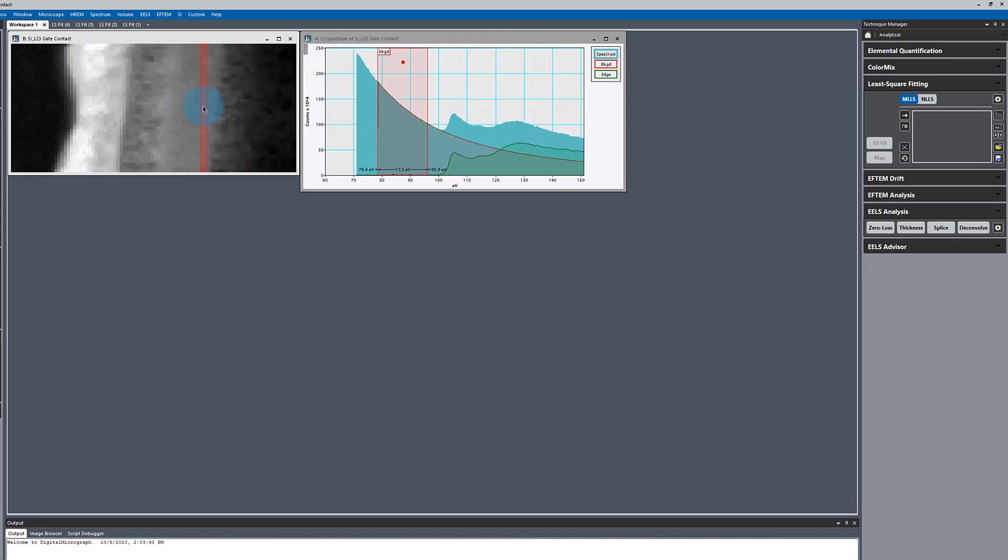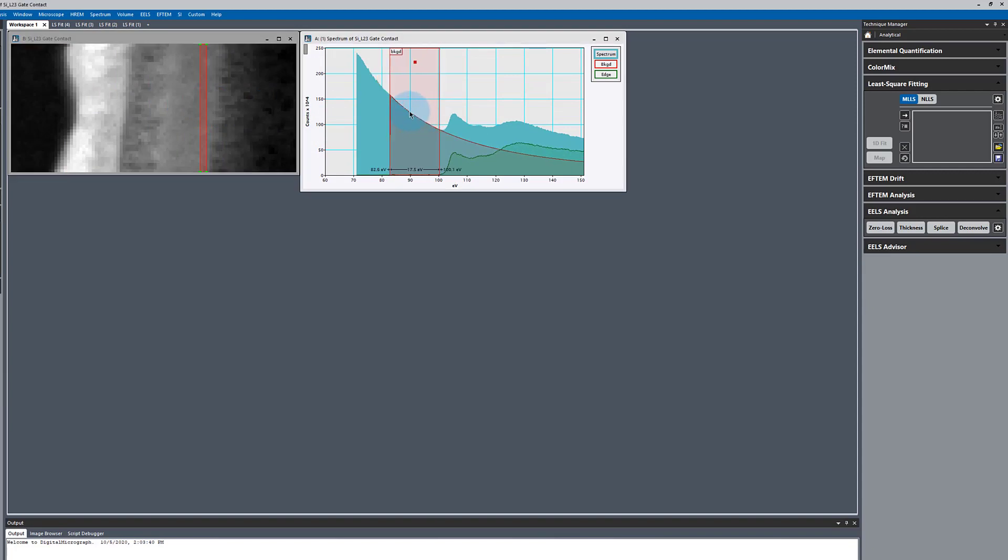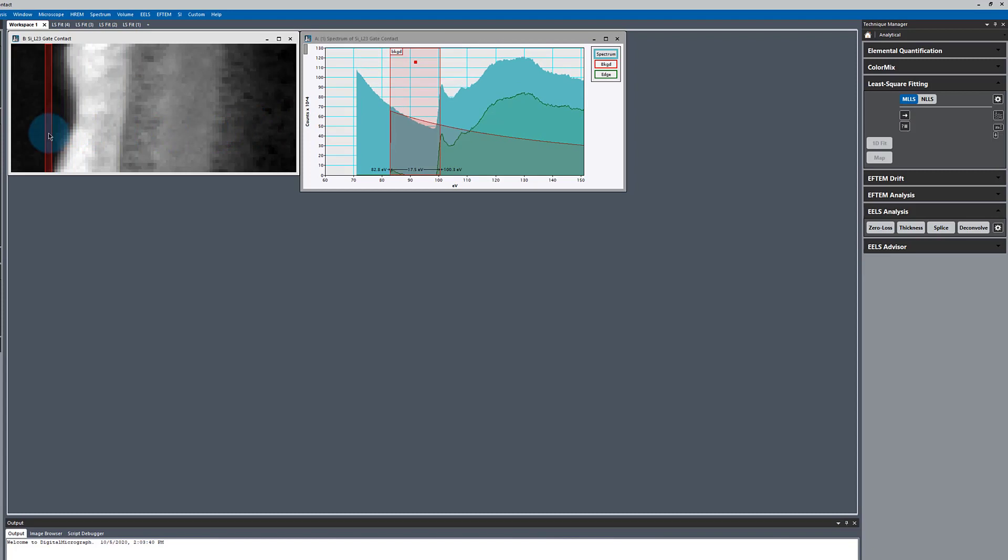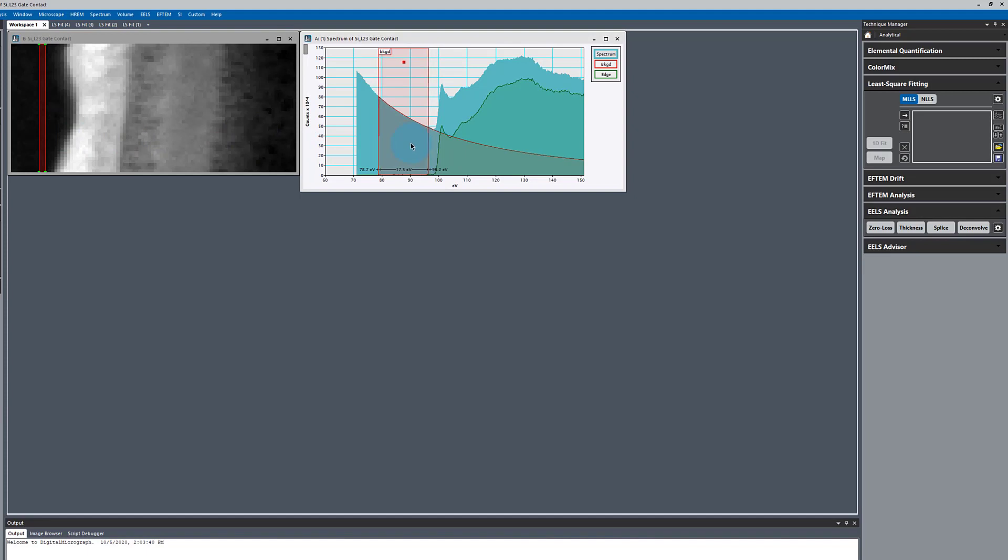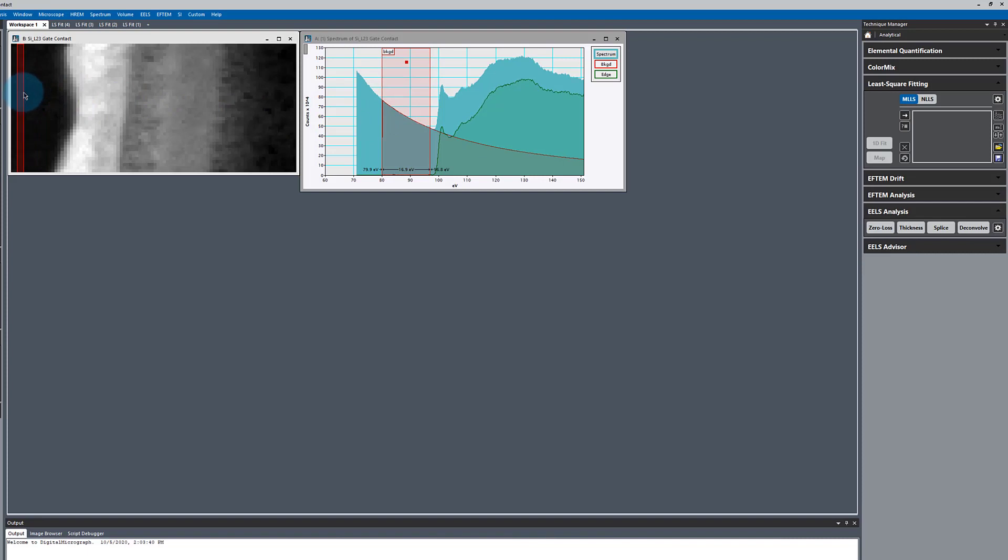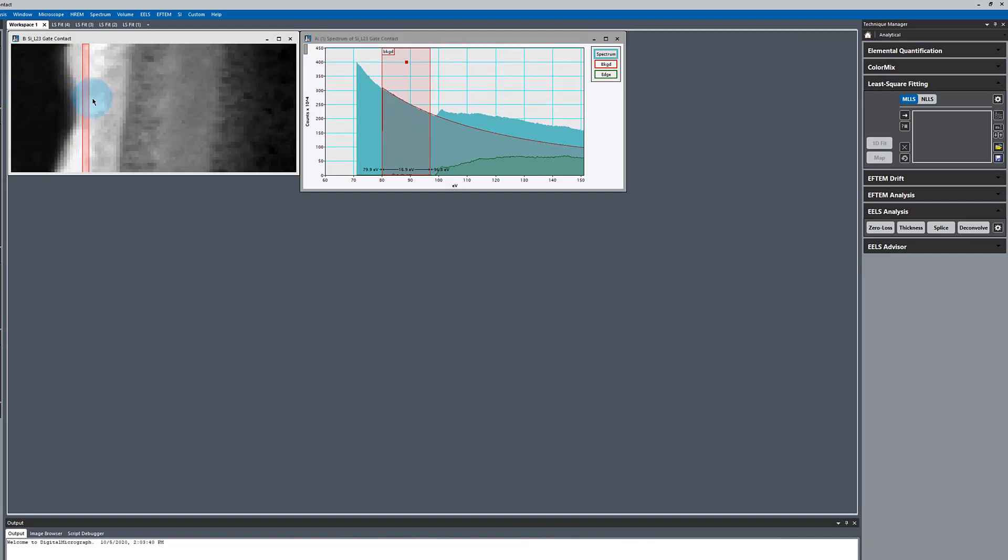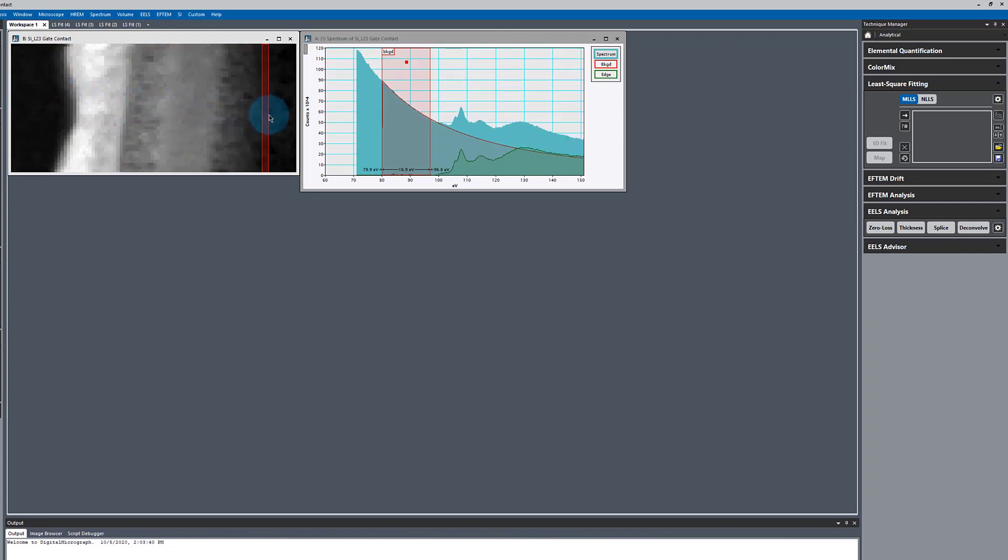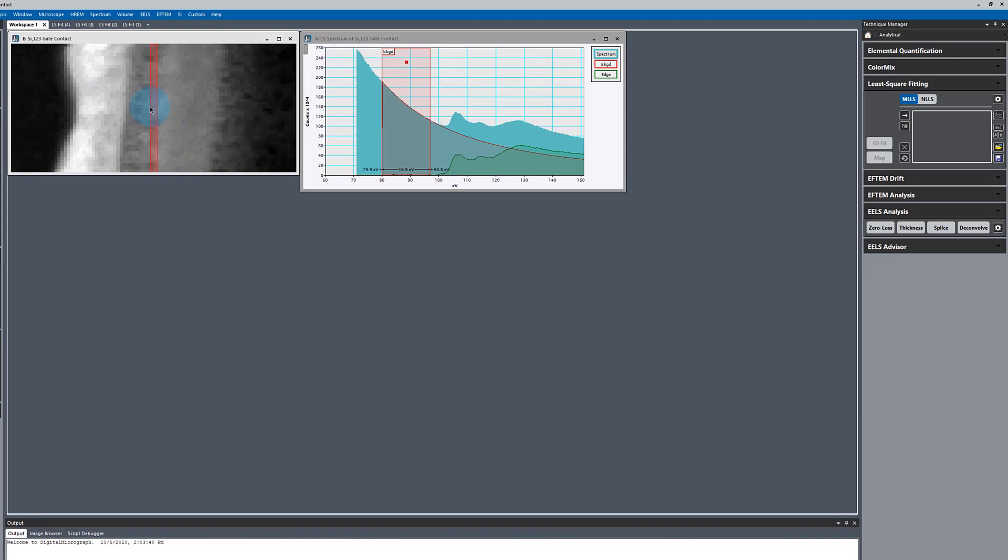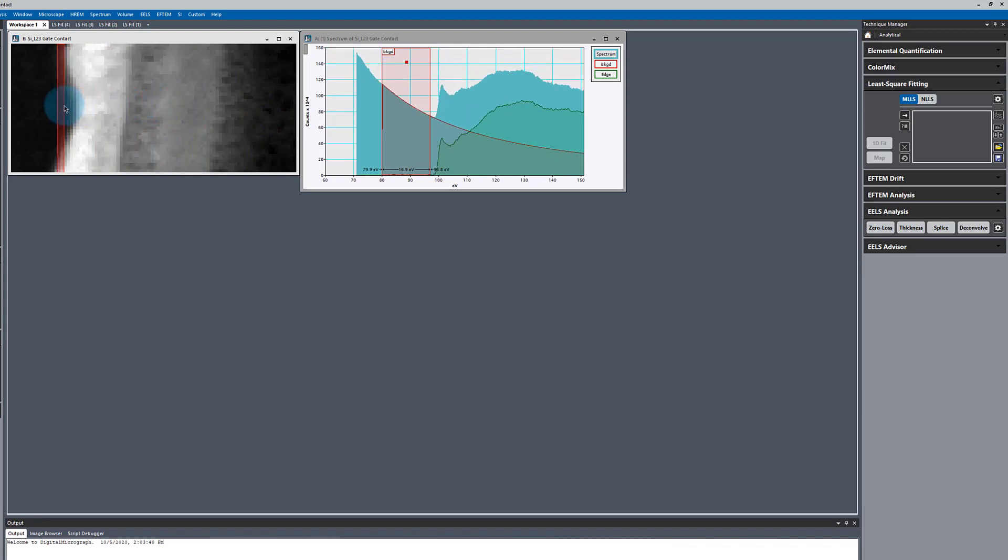We want to be sure that we have one background that fits well in all areas. So if we had started here and placed our background fitting region, we wouldn't have had a good fit over here. So there's got to be one region that fits everything. And this can often be the problem with this method that we're going to use for background subtraction. In this case, we've got a pretty good fit.